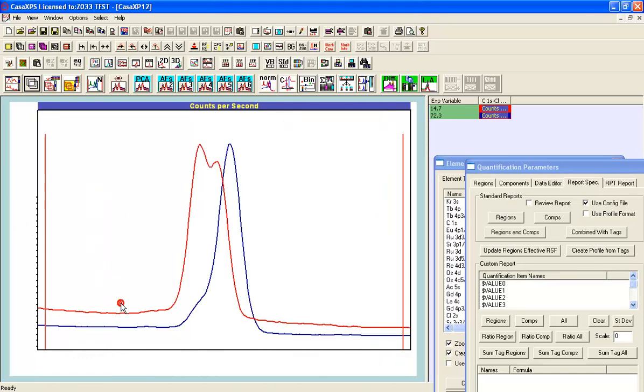Now when we look at these component curves and we consider the carbon 1s, this is a binding energy of about 285 eV after it's calibrated perhaps, but what we can see in these data is that the red component curve corresponds to the PVC. So why do I say that? Well, carbon bonded to chlorine. The chlorine is electronegative, so we'd expect electrons from the carbon to be moved towards the chlorine and away from the carbon. Fewer electrons, greater influence of the nucleus, you'd expect the remaining electrons to be bound more tightly, and so we see a greater binding energy for the carbon bonded to chlorine.